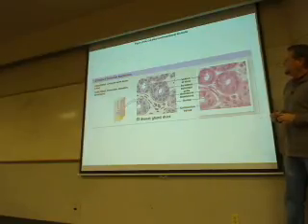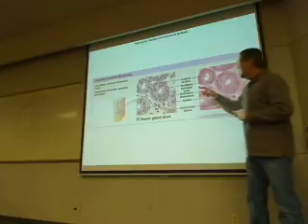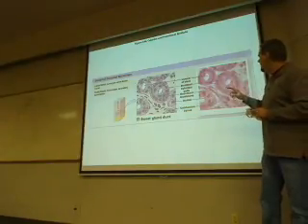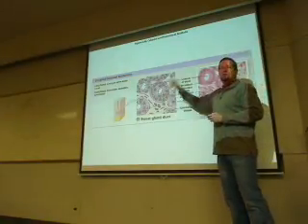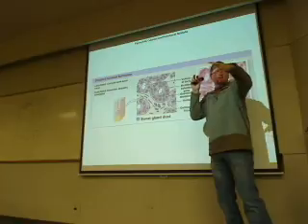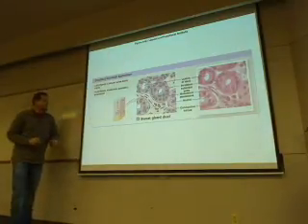All right, so this is stratified cuboidal epithelium, and this guy is really, really rare. In one place I worked, there was a doctor whose specialty was tissues, and he did all kinds of pathology stuff. He lived in South America for a really long time. And if you wanted an argument, just mention that you saw stratified cuboidal and a couple other kinds of tissues that you argued were not there because they were actually transitional tissues. Transitional meaning they were changing from one kind to the other, and you just couldn't stop and start, so you thought they were changing, which is one of the things tissue people argue about.